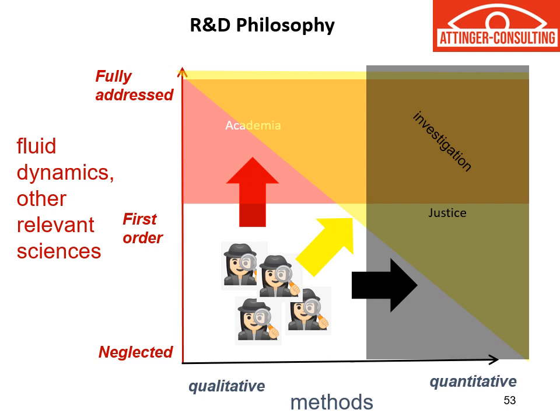But also, I strongly believe that if you want to present things in court, it's better if your argument is supported by some quantitative evidence than just your feeling or your impression as a BPA analyst. So I'm trying to move the field from a qualitative perspective to a quantitative perspective. And I hope this software goes in that direction. And that is going to help both for testimony in court, but also that might provide better tools for doing investigations.